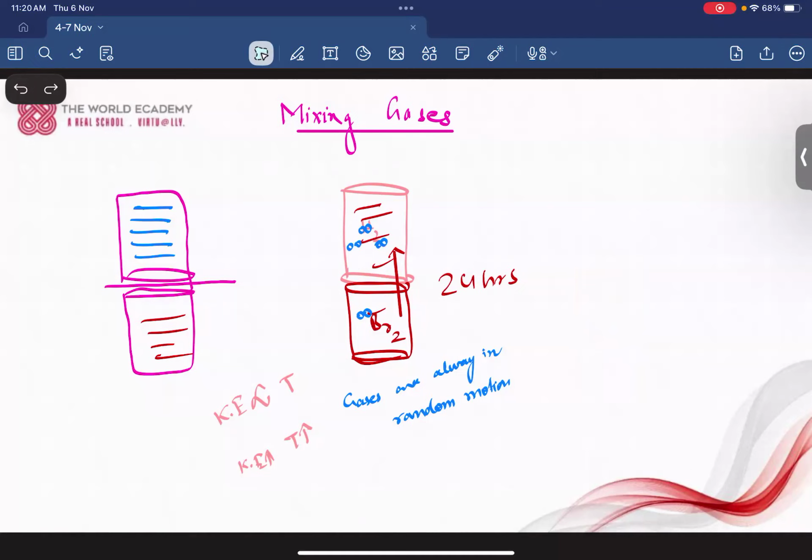Okay, are you getting my point? So it means that hydrogen is present in both the jars. It is also evident that both the jars carry hydrogen and Br2. Br2 we can see by its color, but hydrogen we cannot see. So we will try with a matchstick. If it starts popping and igniting inside, it means hydrogen gas is there.